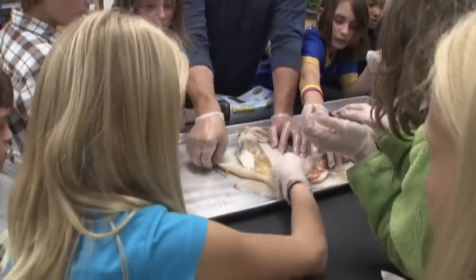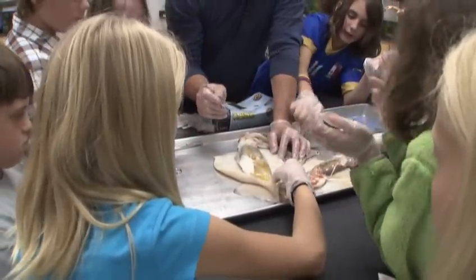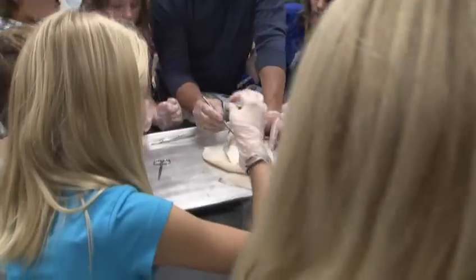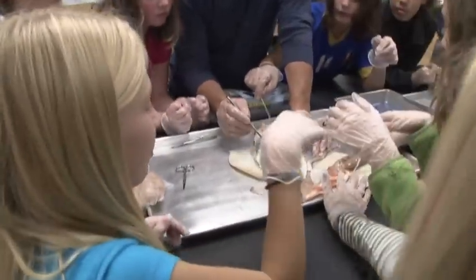Now I want to show you one other thing. Who has the pen? Who's got the pen? Okay, here's the ink gland. This is the rectum running right along here. Oh, here is that how they? Yes, this is sepia. Now watch.